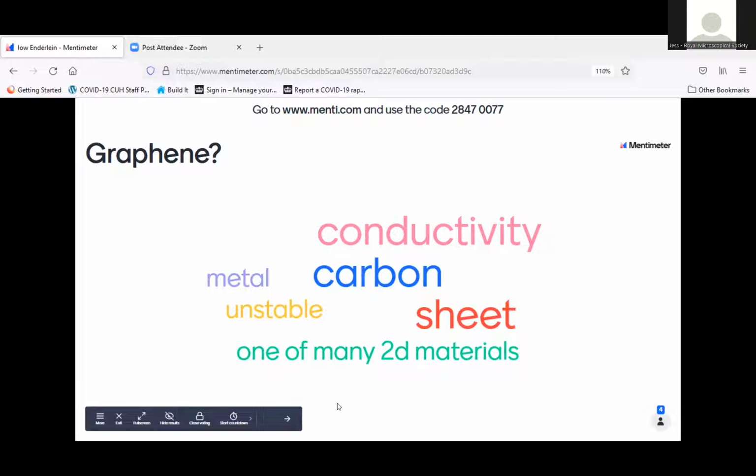So I see one question by Alice Bender. Shall I answer it? Sure, you can actually. While we're talking, if you could just say what the acronym is. I guess it's fluorescence lifetime. Yeah, this is fluorescence lifetime correlation spectroscopy. I did not talk about it today. This is one method we developed many years ago, and also Martin Hof in Prague, and Alice was part of it.